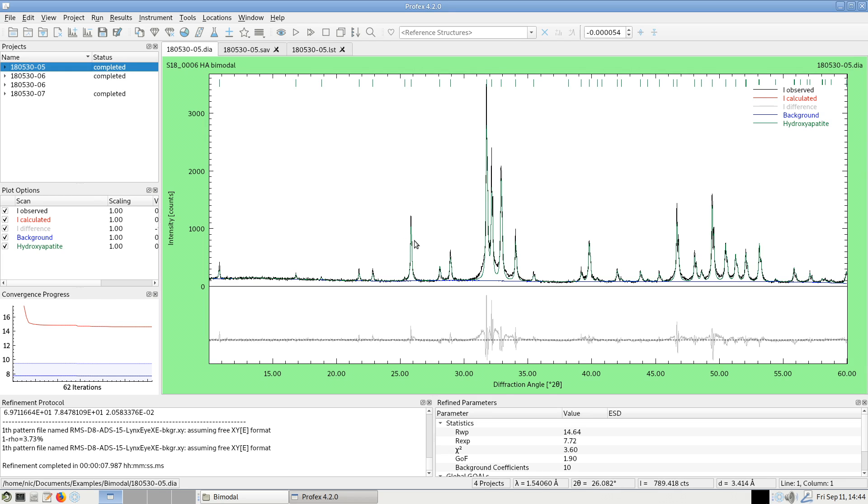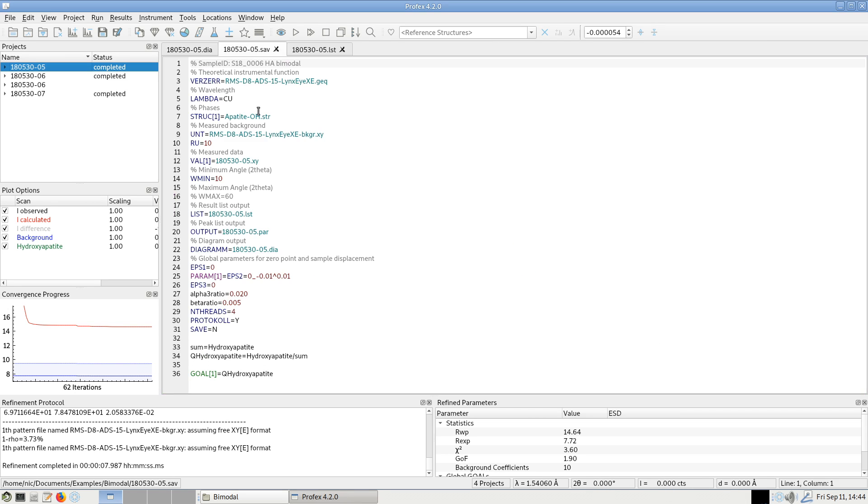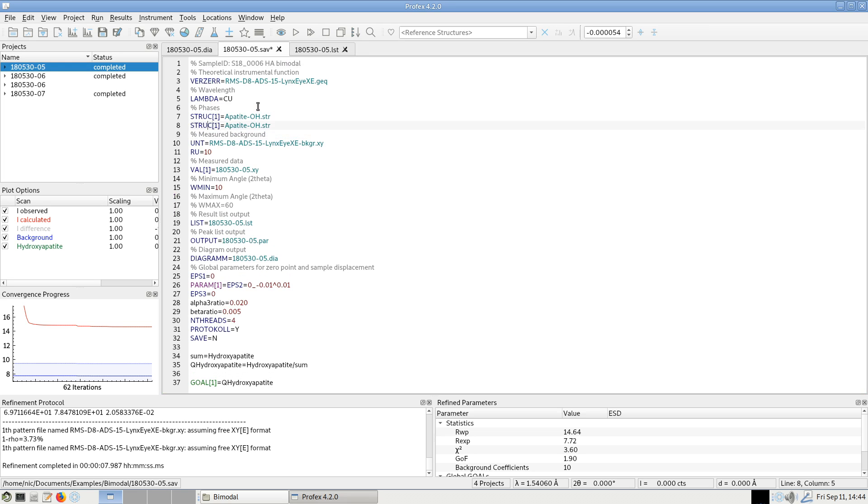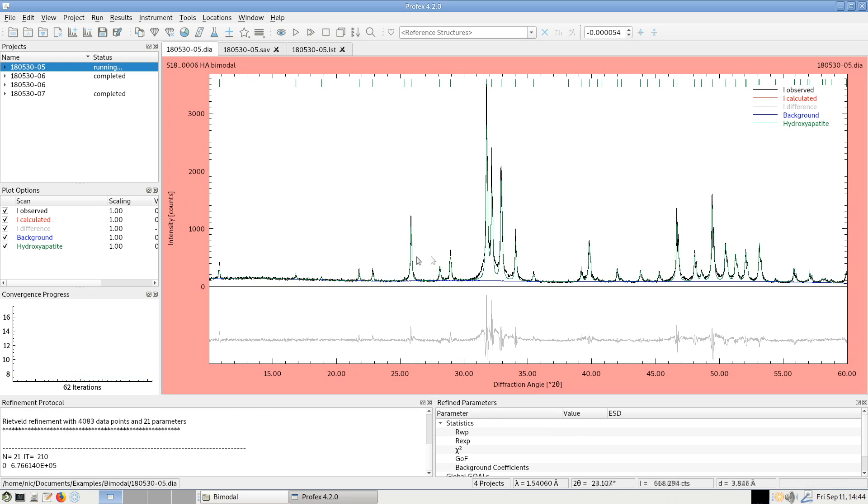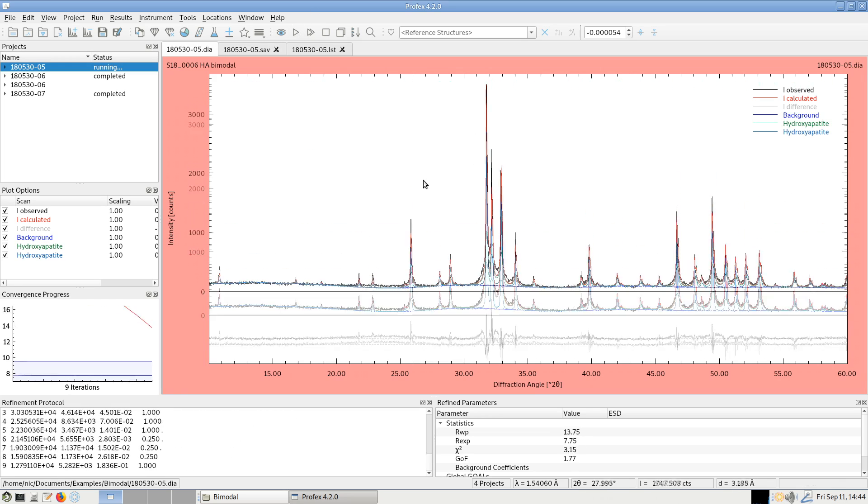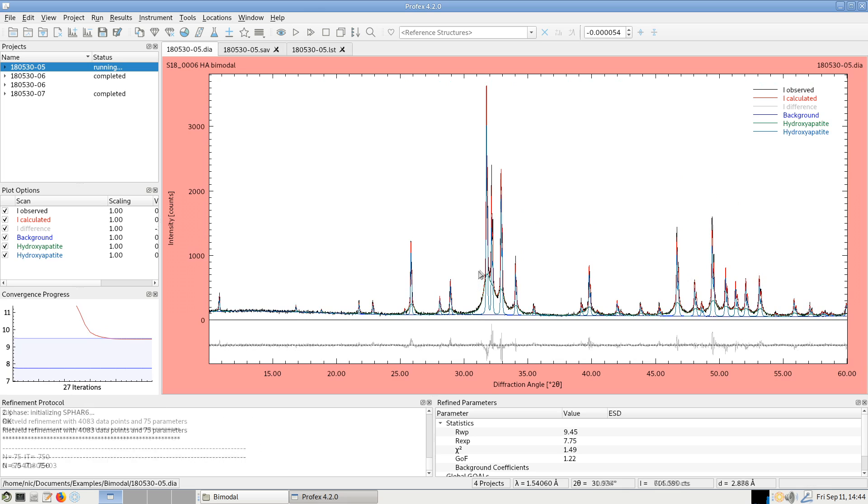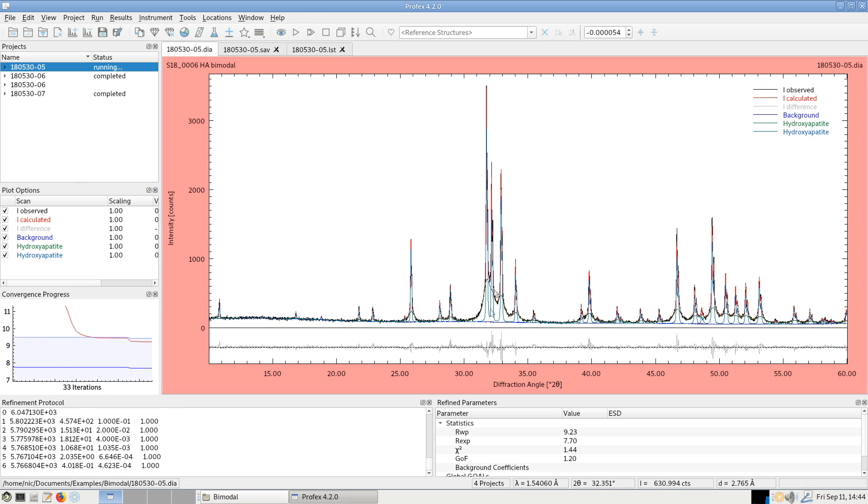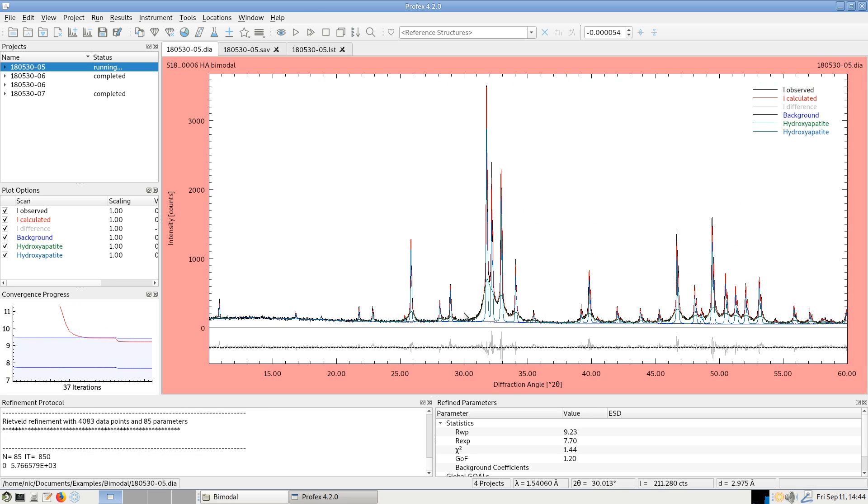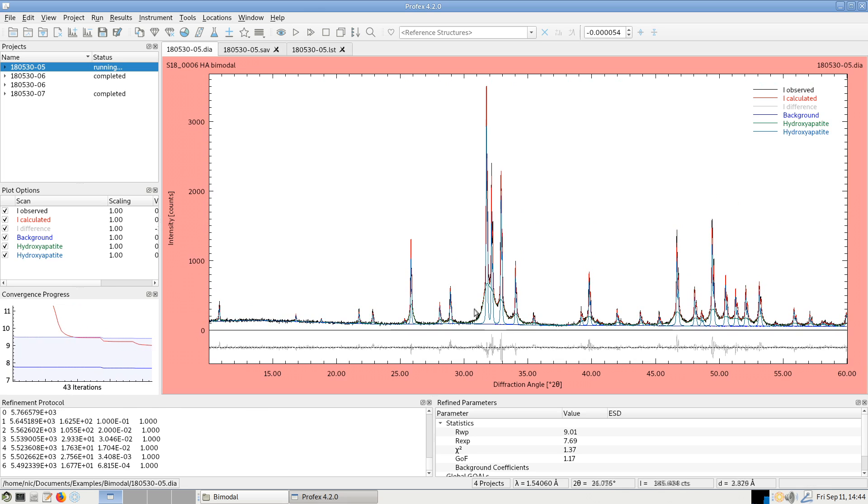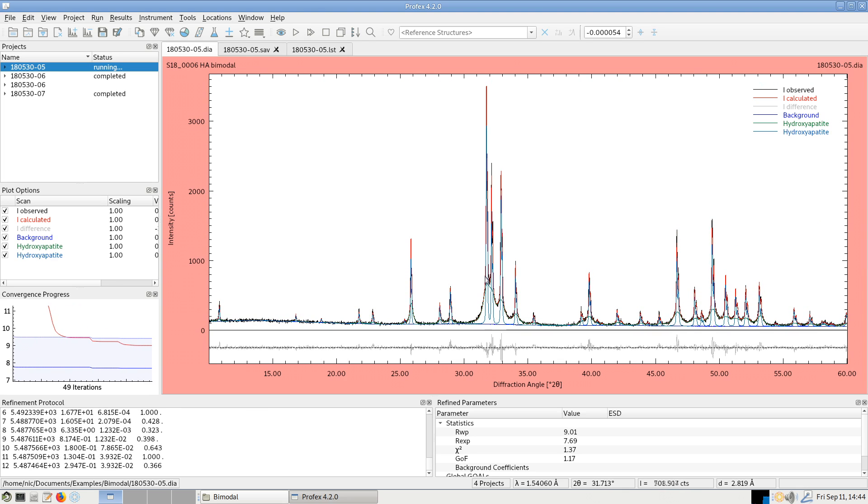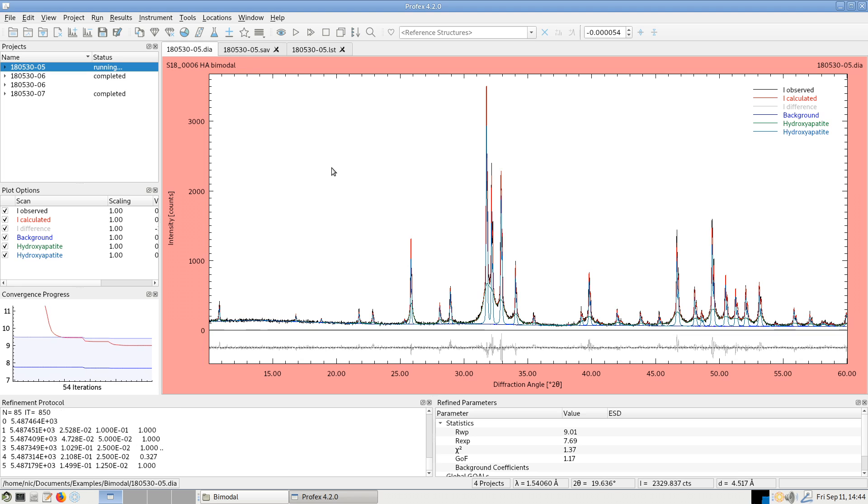The first one is to treat the two fractions as totally separate phases. So we refine two apatite phases separately. And one of them will match the highly crystalline phase and the other one will match the nanocrystalline phase with the broad overlapping peaks.